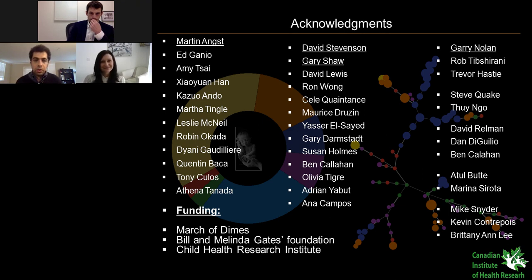Mass cytometry is unique in that it increases the number of simultaneous measurements in various cell types, but it also doesn't produce an extremely high number of measurements like we would get from sequencing assays. So we have to balance out the number of measurements versus the amount of information that is provided. There are multiple ways to do that. We talked about one of them here.